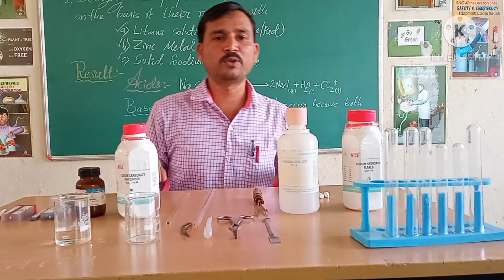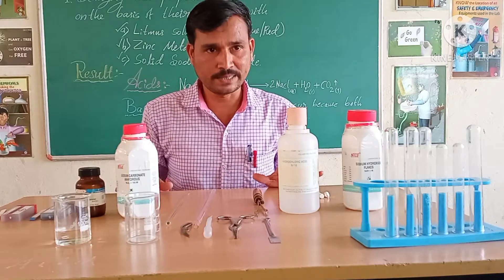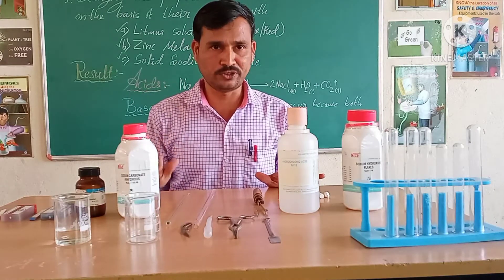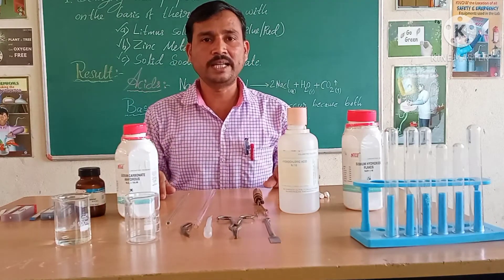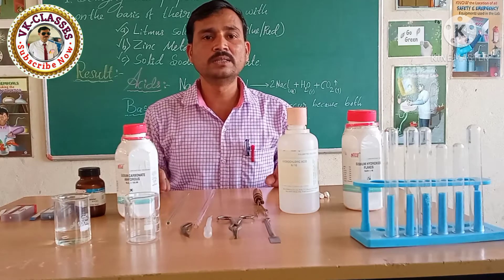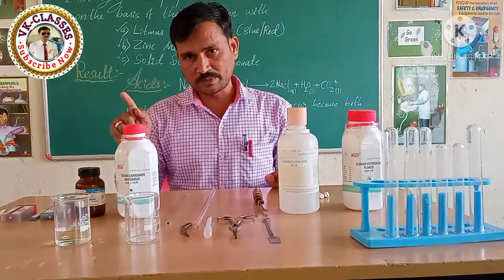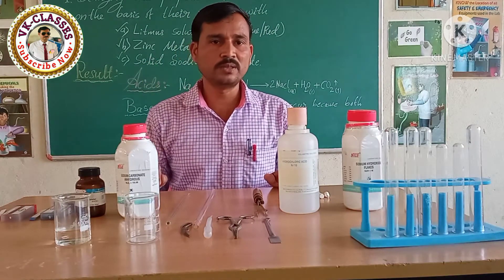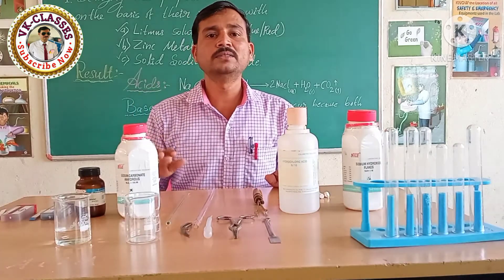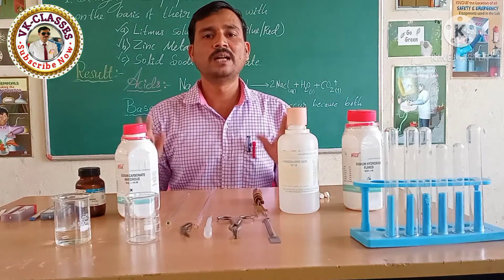Hello everyone, welcome to my YouTube channel. Today we will study a new concept — the list of experiments of Class 10th. So let us study practical number 1: studying the properties of acid and base with litmus papers or litmus solution, zinc metal, and solid sodium carbonate.